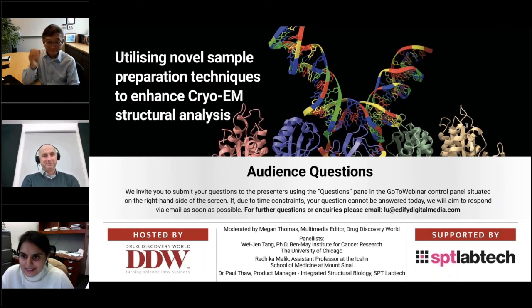So we started with tilting, and that took some time for us to really optimize things. The ice becomes very thick, and so the quality of your data sets is not as good. For a year and a half, we were struggling with our APO data set by just tilting things and finding the best grid to work with. And then chameleon came. Actually, we started when spotiton was getting developed, and then the first model of chameleon came when we got our good grids. So it took maybe a few months with chameleon.